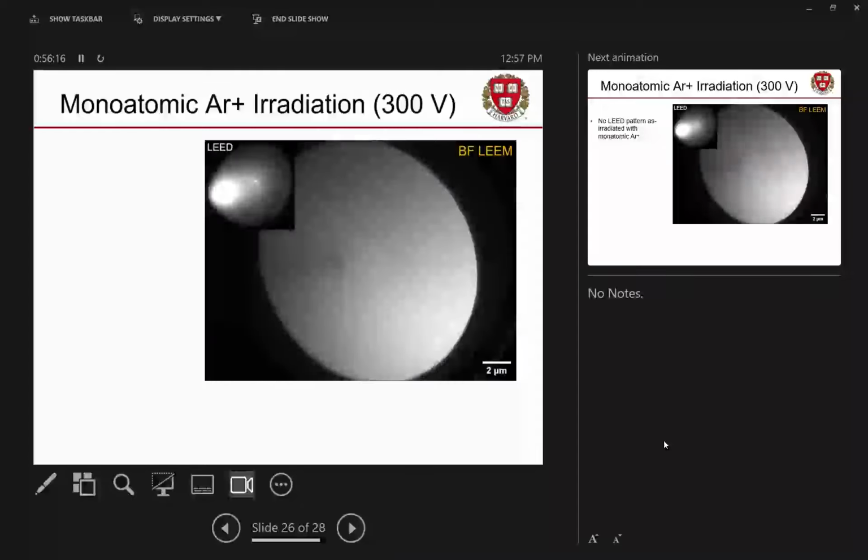All right. We tried two different things. We tried just hitting it with the argon sputter gun and chewing it up. Fairly gentle, 300 volts, not bad. Certainly cleaned off the dirt. Now we have a central beam in here, so we're reflecting our electron beam off properly. It's not being absorbed by dirt, but no diffraction pattern.